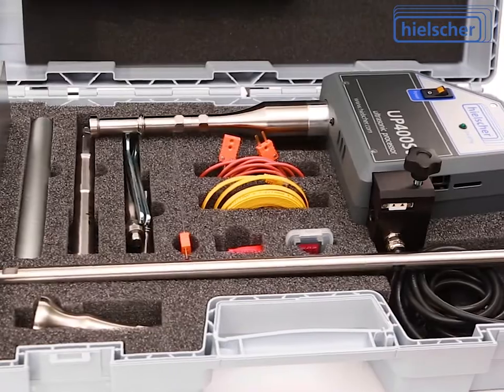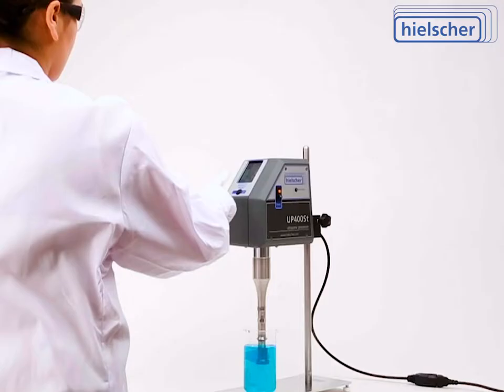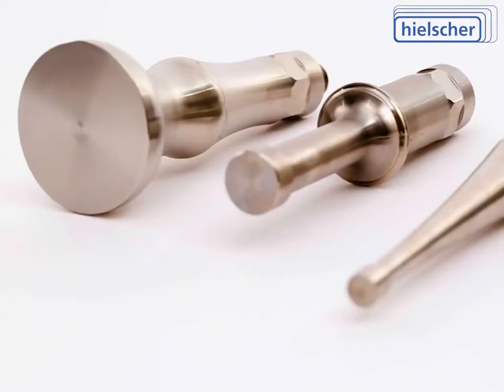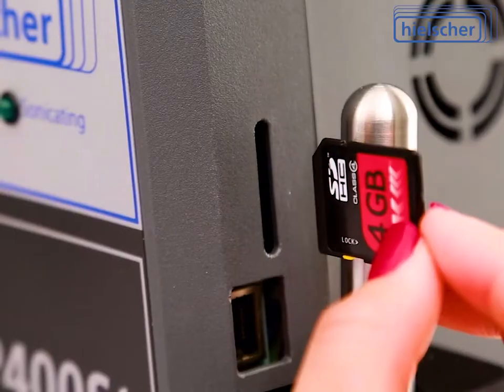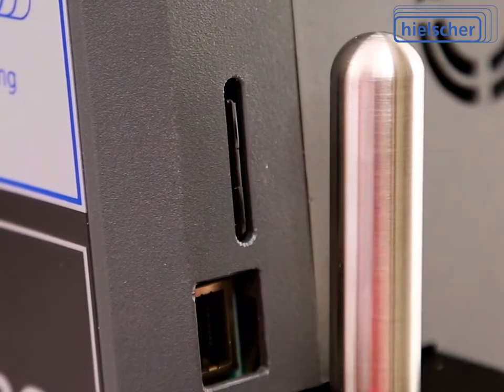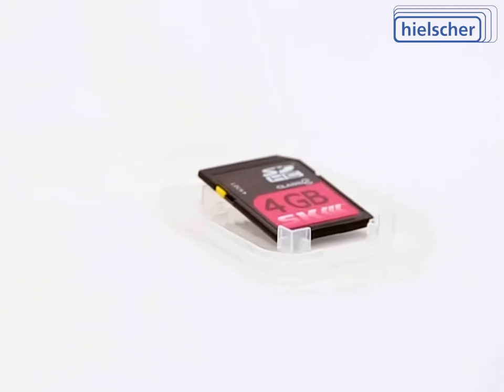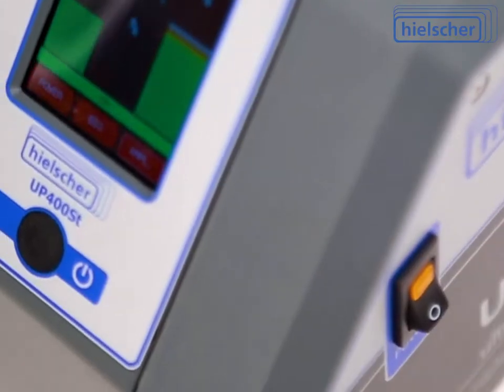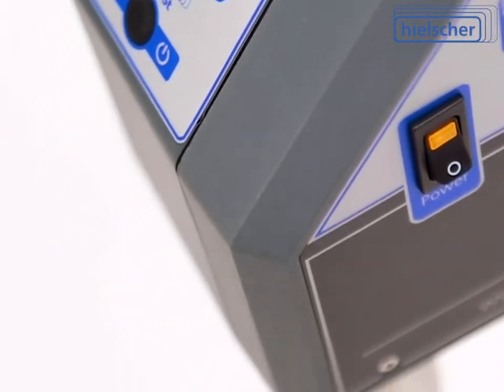Setting up the device is easy — just connect to a wall outlet and push the start button. Mounting and changing sonotrodes is done within minutes without effort. Data recording for later analysis starts automatically as soon as the ultrasonicator is switched on. With an included SD card, the ultrasonic device writes data protocols automatically, naming the files with date and time.